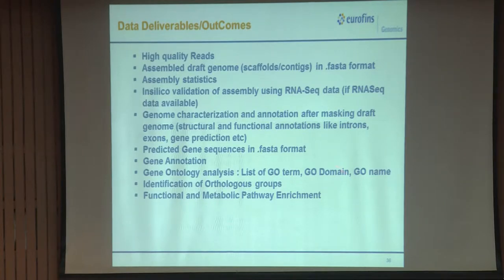And then we have different GO terms, the GO classification. This is the outcome.